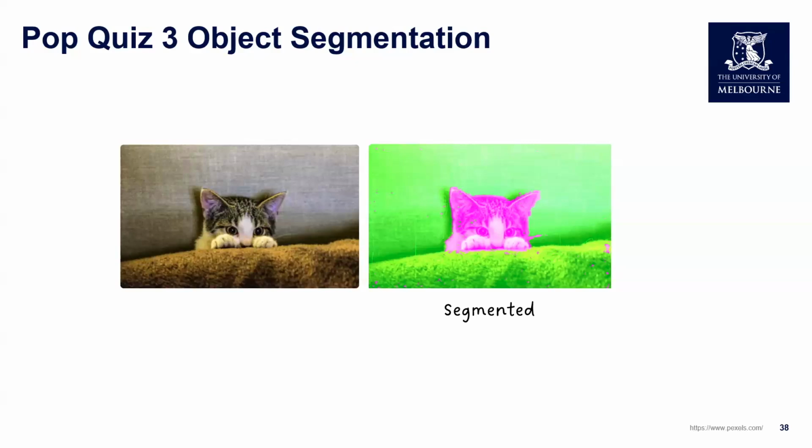We don't want to apply the same threshold value, which is a single value that may not work on images with different background levels, or apply different threshold values manually. That includes lots of subjectivity, so it would be really hard to explain how you ended up choosing the values.